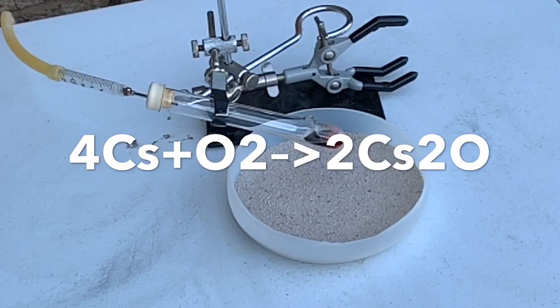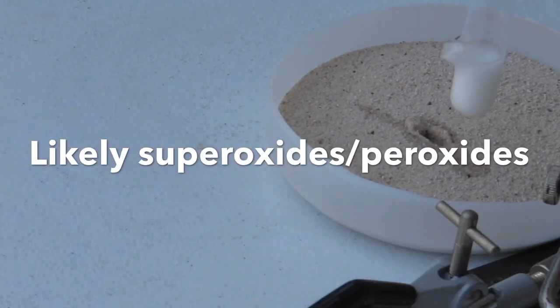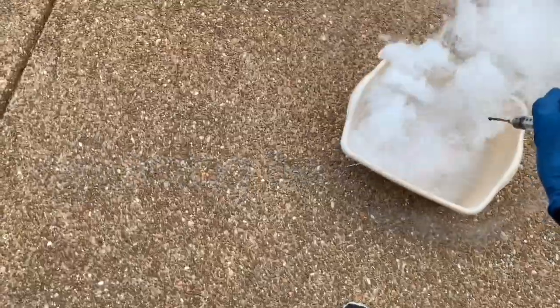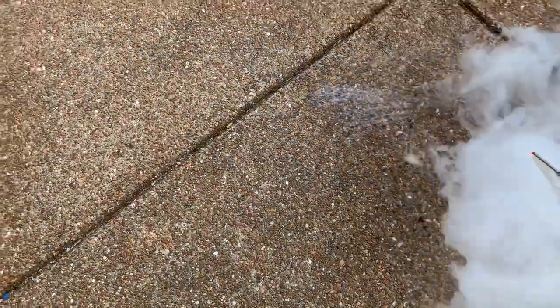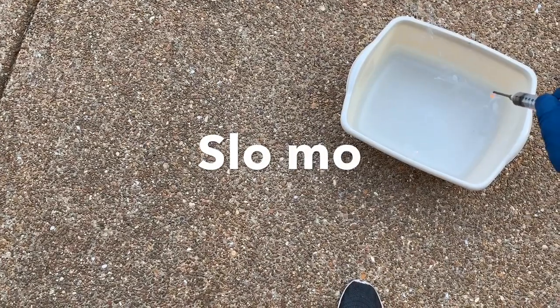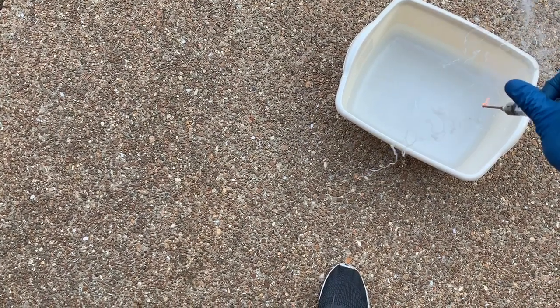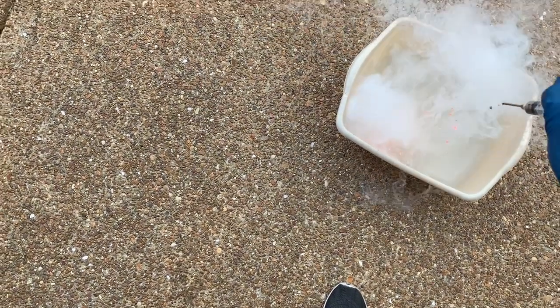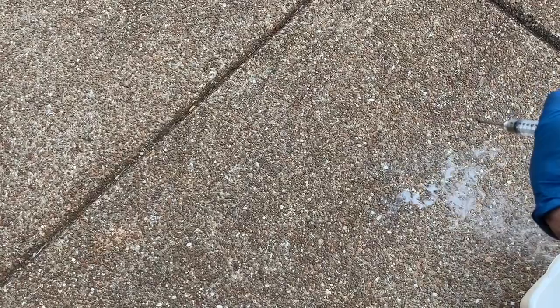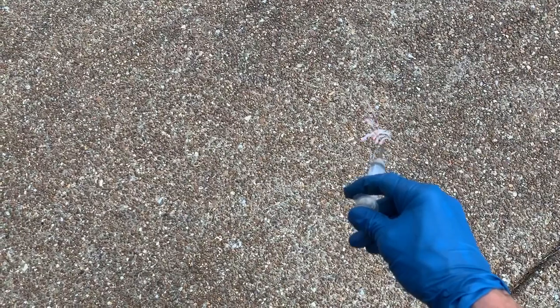There you go — you can see what happens. It instantly ignites in oxygen, and that smoke you can see there is cesium oxide.